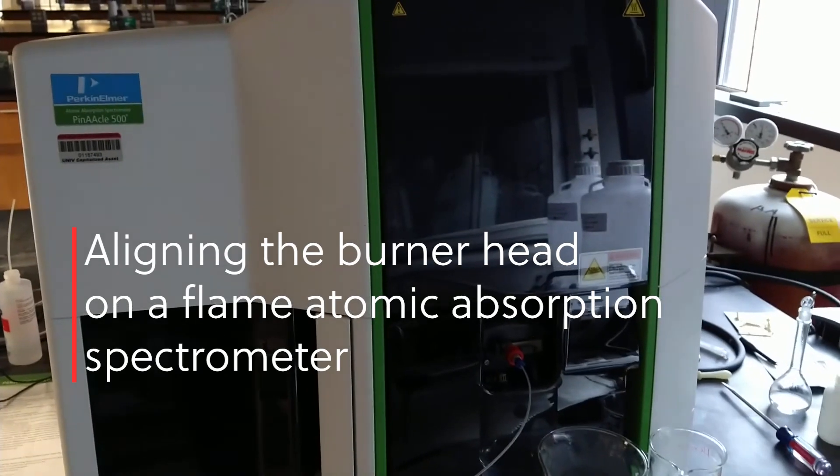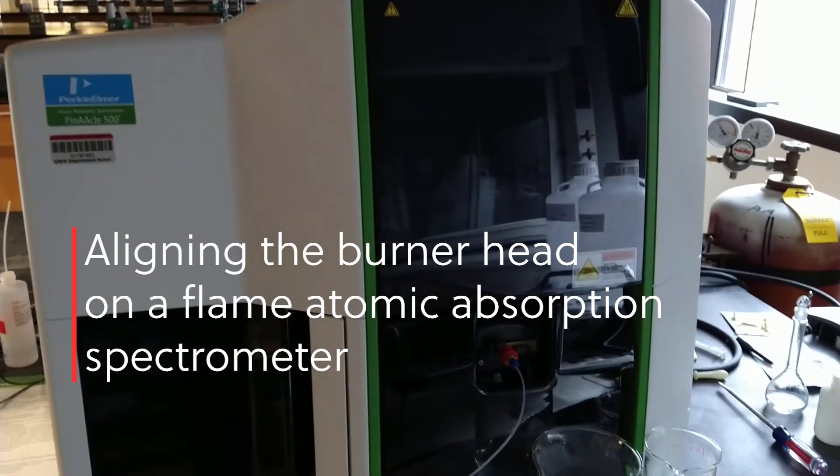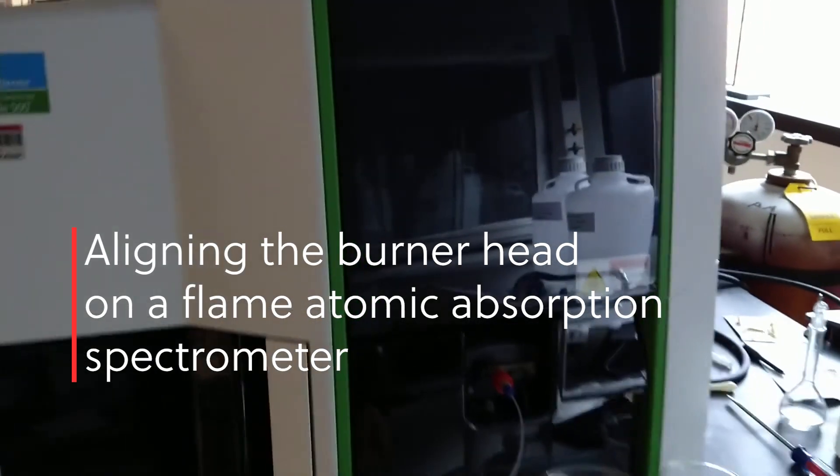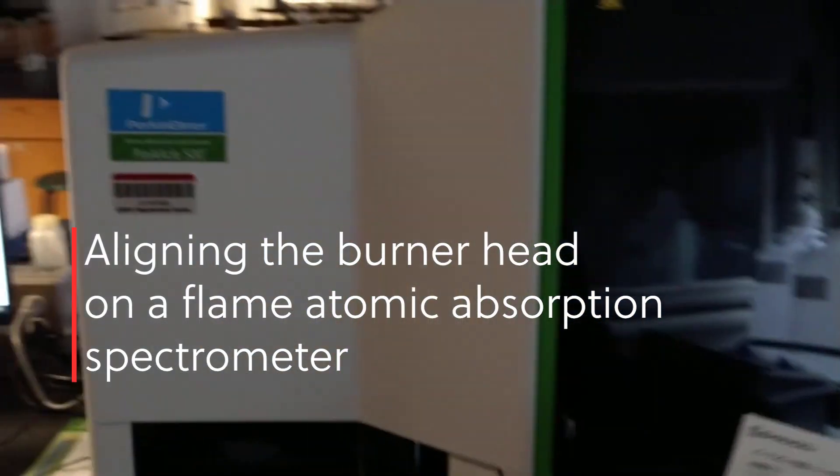When doing flame atomic absorption spectroscopy, it's important that the hollow cathode lamp light source goes directly across the burner, and so it's necessary to have proper burner head alignment. In order to align the burner head, there's a useful tool.